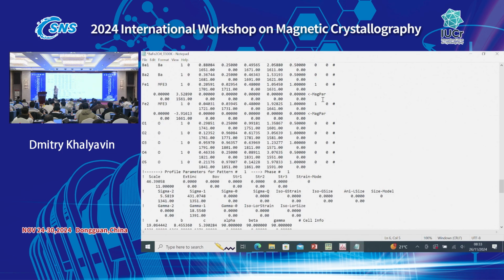Yeah, so normally there are 5 banks. I think in your case you refine them at the same time, but if there's absorption, for example, europium, maybe we shouldn't do that. We should focus on one bank first. Yes, I mean, it's all arbitrary. You need to decide what is the best situation. I did it just because you can, in theory.